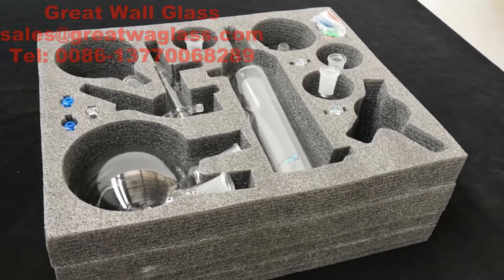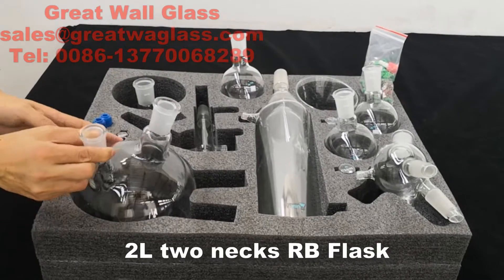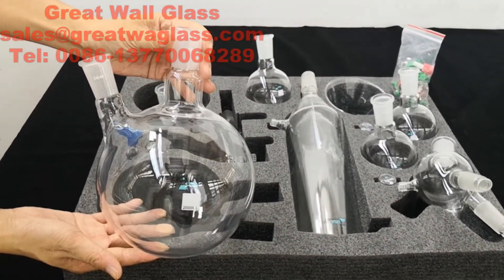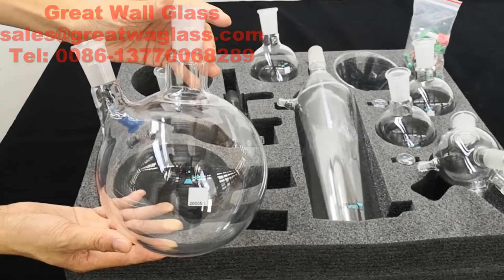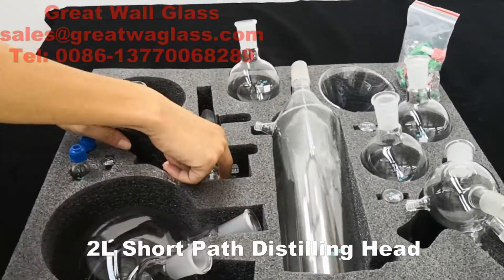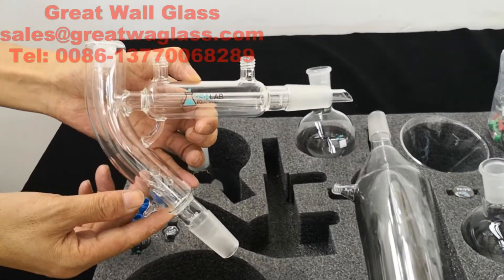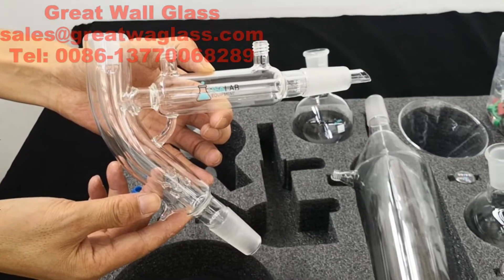All items include: one piece of two-liter, two-neck round boiling flask, and one piece of two-liter short path distillation head.